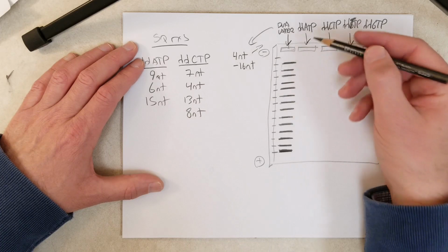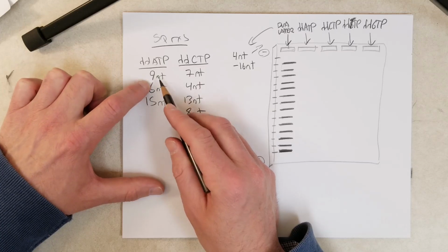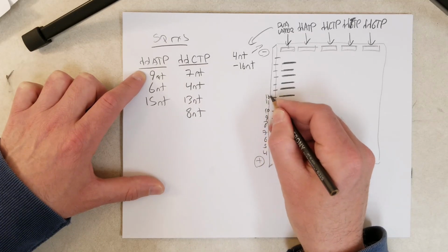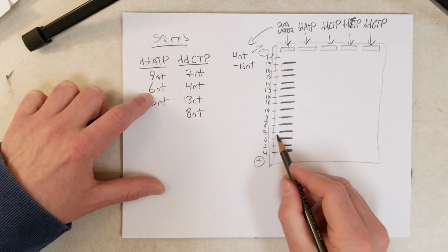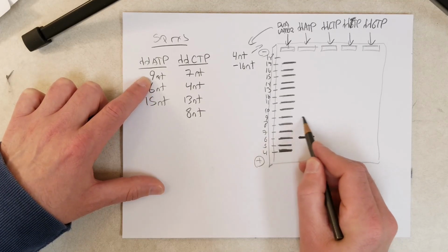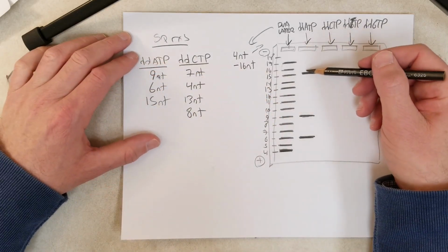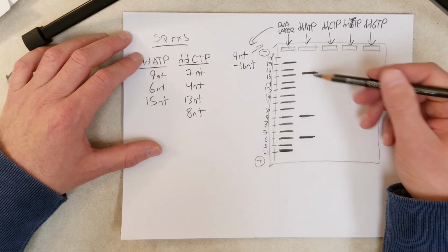Now, when we ran our ddATP reaction, what do we see there? Well, we predicted we should see 6, 9, and 15. So this is going to be 4, 5, 6, 7. I'll put numbers in here so we can keep track. We should see a band at 6, a band at 9, and a band at 15. So that is for the ddATP reaction. We see 3 DNA molecules, 1 at 6, 1 at 9, 1 at 15.